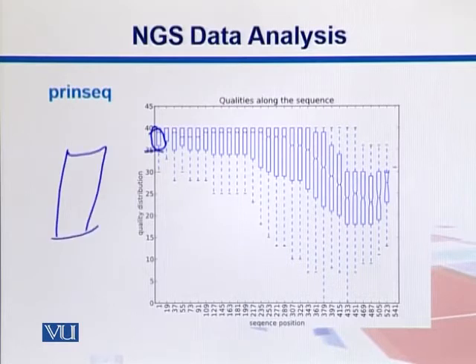So this representation is called a box plot, where we can plot all the values, and these numbers, if we plot them together, become a distribution. So in the middle we have the middlemost value, or the median, which splits the data into two halves, and then we have the data in quarters. So here is the lower 25%, here are the middle ones, and then here is the 50th to 75th percentile, and then we have the total upper 25%, which is right here.